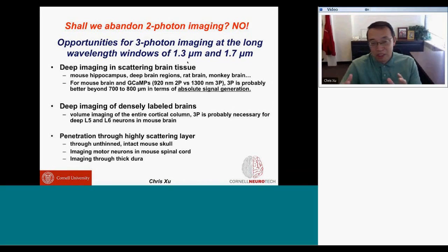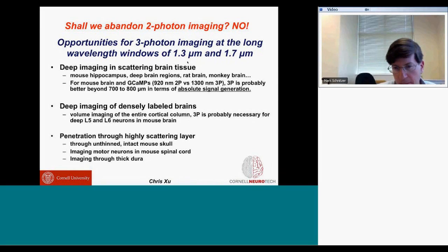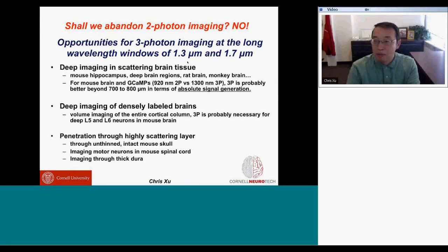You know, 2-photon people have been trying to develop large cross-section lines for the last 20, 25 years. And it turns out to be very difficult. I think other than what you're doing, screening different proteins for cross-section, I'm not sure there's actually a theoretical approach to design something from scratch, for example. That's probably very difficult. In terms of wavelengths, I think with the two windows we have at 1.3 and 1.7, we can cover most of it already. The wavelength probably will be okay already.